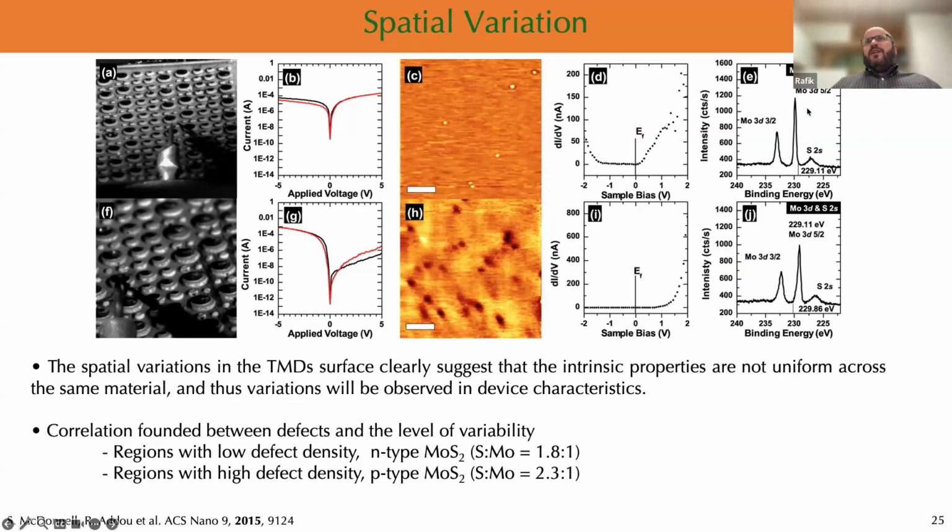And we can also see only a single peak, meaning that we have only one chemical state of molybdenum, which is molybdenum bonded to sulfur. And because this one was n-type, from the IV curve we also see n-type behavior of this MoS2 in this hole.